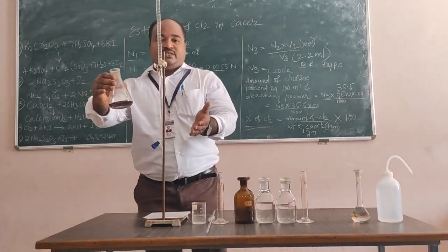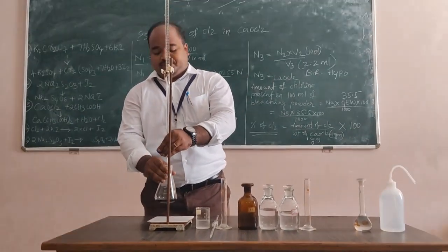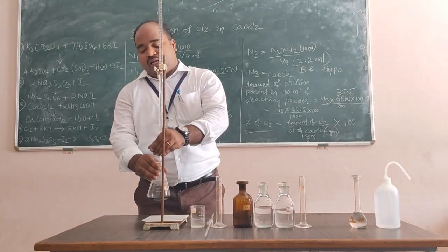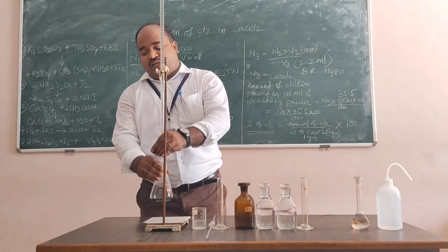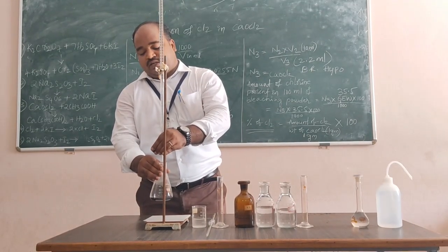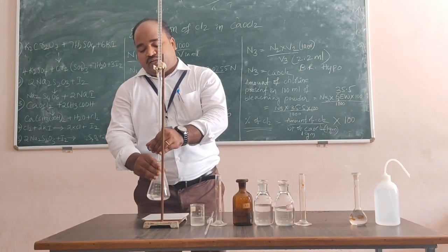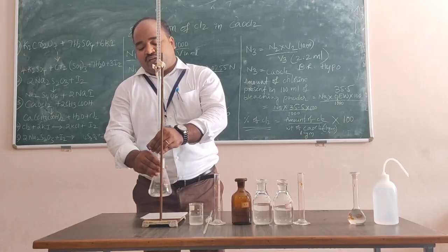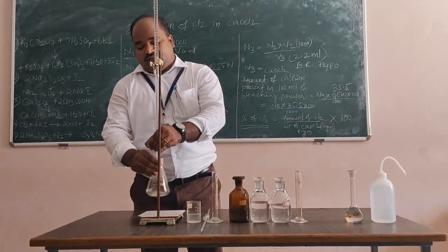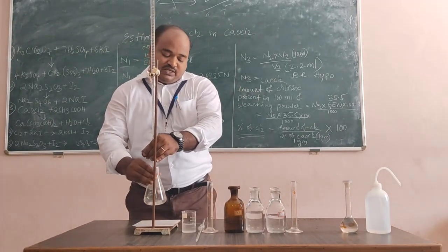Next we will start this titration. This is our reagent solution. We are going to titrate against sodium thiosulfate, which is hypo. Always keep your left three fingers on the knob of the burette and add hypo drop by drop and titrate, and with your right hand you need to shake the conical flask slowly and gently, as the reaction will start slowly.